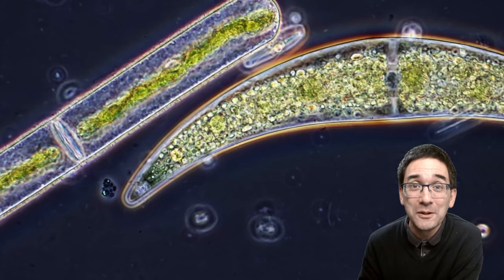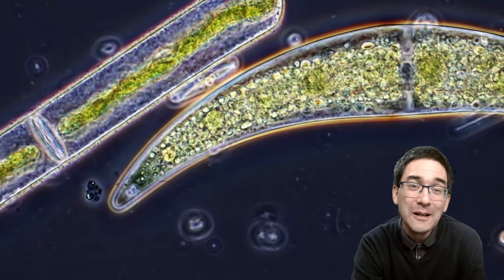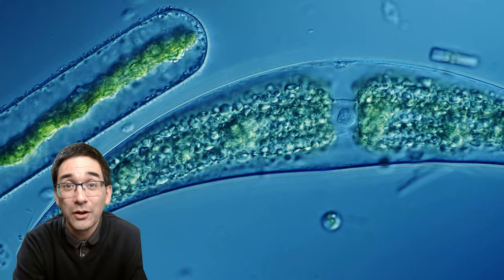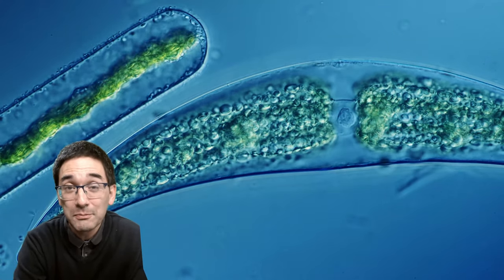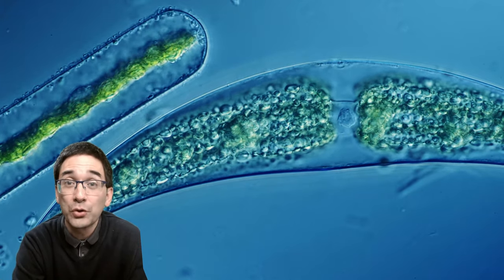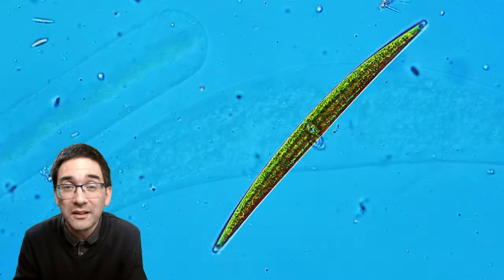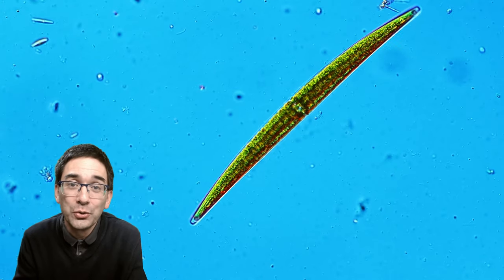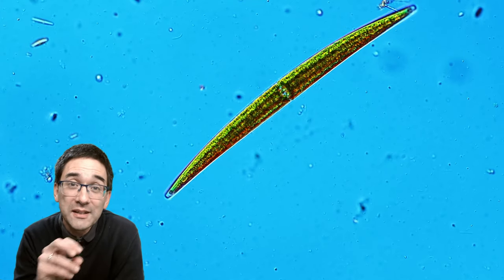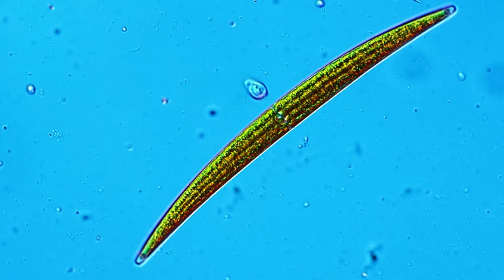There's also a diatom moving around — gliding diatoms — and it's a fascinating display of biodiversity. Algae produce especially large amounts of oxygen in the aquatic environment and absorb a lot of carbon dioxide, completing the carbon cycle. Here's another species of Closterium — a slightly curved structure. In the center you can see the nucleus, where the DNA is. These algae can reproduce both asexually and sexually.